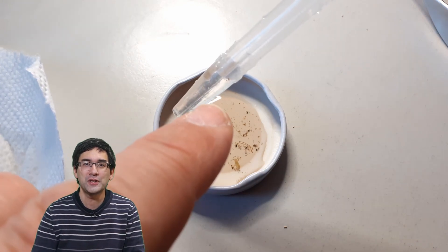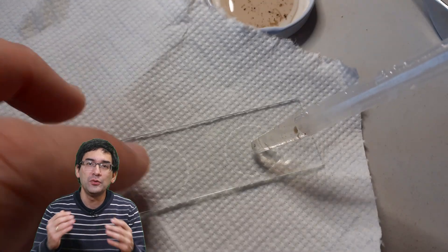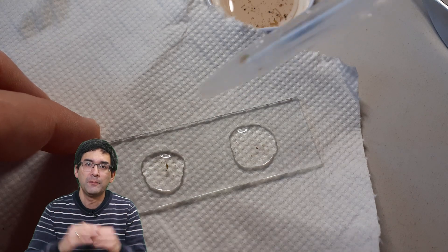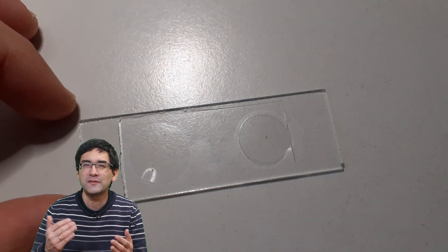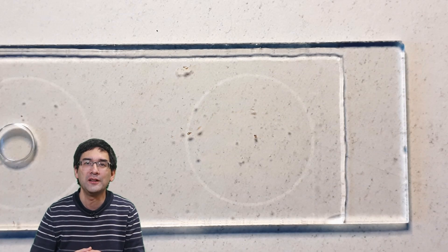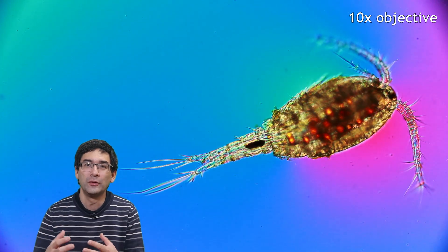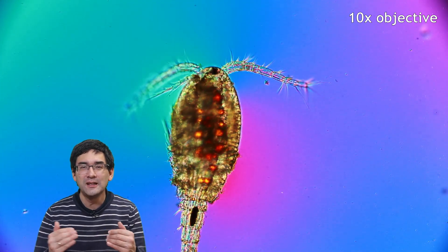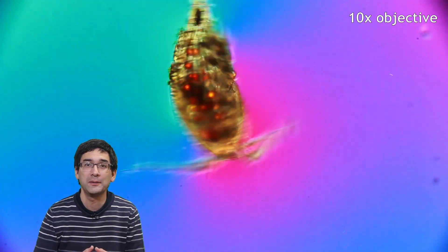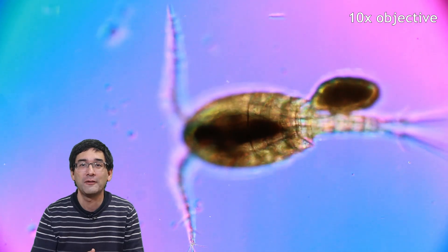The microscope slide I used was one with indentations — concave microscope slides — because I did not want the cover glass to crush the Cyclops. A thin water film would inhibit their movement, and it could actually crush them, which I wanted to avoid. I also wanted to observe their natural movement. I used a fairly large cover glass, which isn't necessary but works well. The beautiful background color you see is because I'm using polarized light, which gives it a very attractive coloring. Movement is somewhat inhibited by the concave slide, which is actually helpful, though magnifications above about 10x are not suitable as the organisms move out of the field of view.